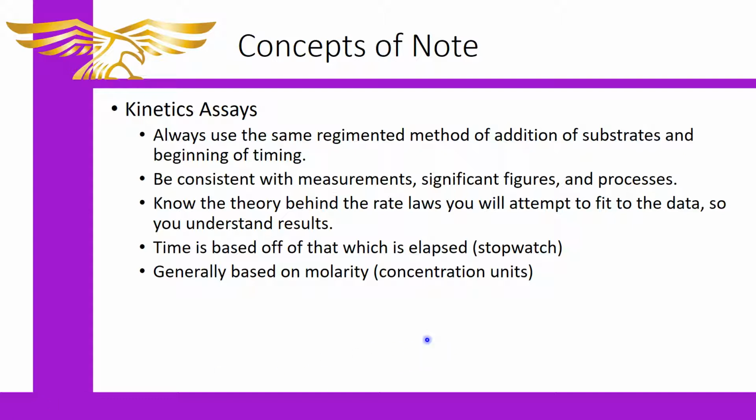And that's pretty much all there is to this one experiment. It's a pretty short experiment. It doesn't take too horribly long to do, and we're looking for a very simple thing, just the differences in time and how we can compare these different reaction systems to see why certain things are said to be more favorable than others. And you can actually see this for yourself. So it's a good start to reactions.